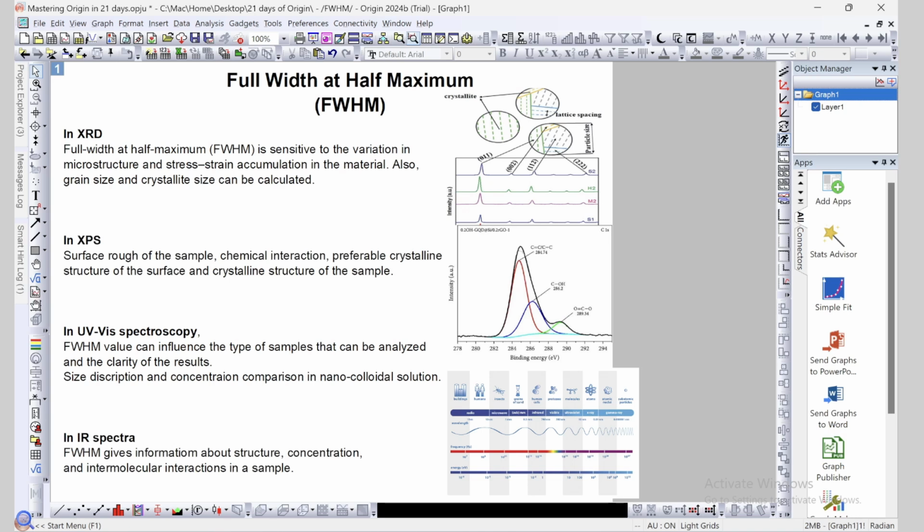For example, if we have the same concentration and the size distribution is the same, you would always have the same full width at half maximum. In pharmaceutical industries, this full width at half maximum helps to identify the purity of a compound and the repeatability during the synthesis of different drugs. So in pharmaceutical industries, UV-visible spectroscopy and full width at half maximum are a very, very important criterion to have control on the quality and the production size.